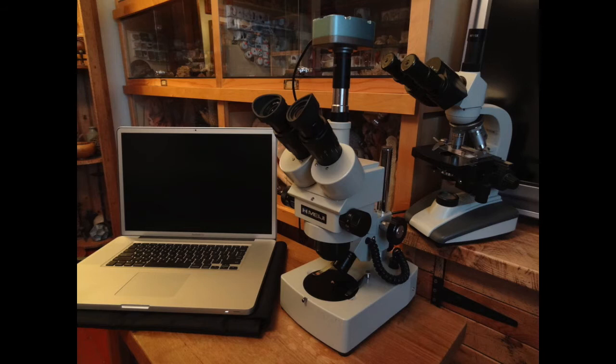Both of these microscopes are trinocular, which means they've got a third eyepiece. You can see on the front one there's a camera attached to the top of it, and that goes down into my laptop so I can view things on my screen.